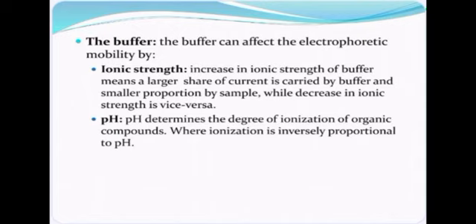Second one, pH. pH determines the degree of ionization of organic compound, where ionization is inversely proportional to pH. So buffer pH also affects the gel electrophoresis.